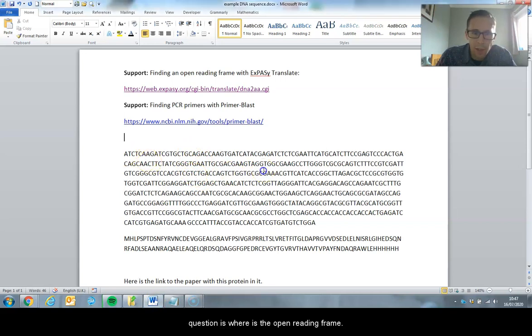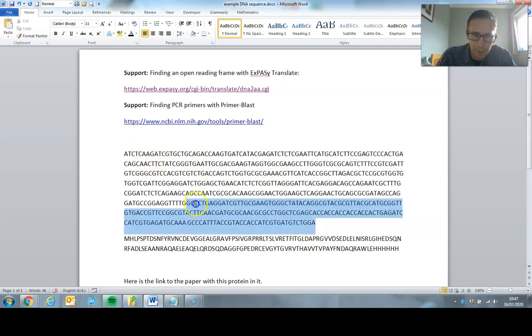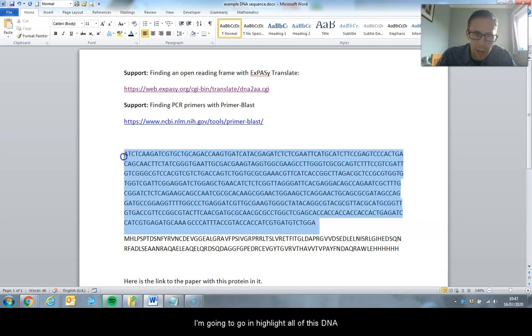My question is, where is the open reading frame? I'm going to highlight and copy all of this DNA.